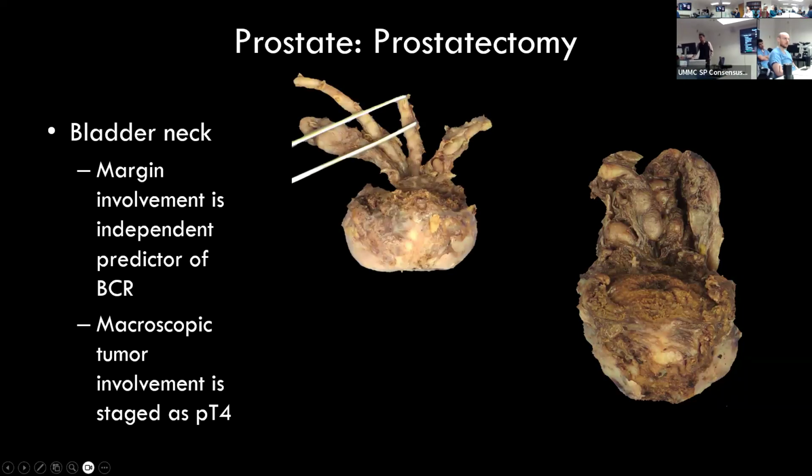So here's another look. At the front of the prostate, this is the anterior fibromuscular stroma. This area is roughened because there is no pseudocapsule, unlike on the lateral aspects. And that's the bladder neck area. Here you can see it's a little bit different. So each case is going to be a little bit different, depending on how the surgeon resects it. Okay.